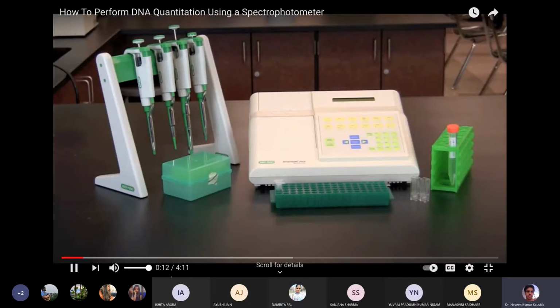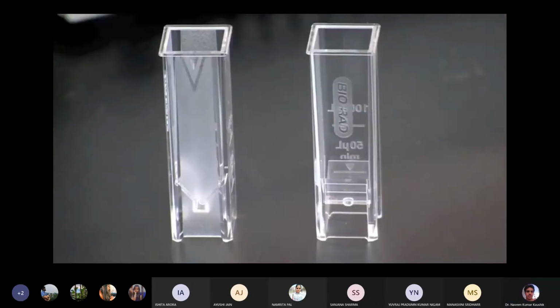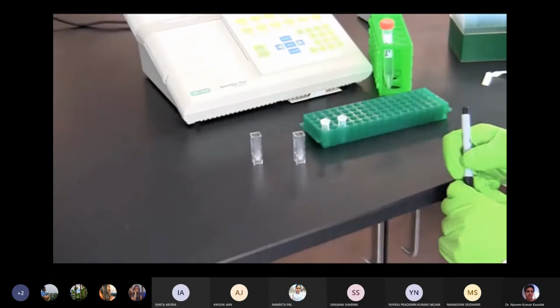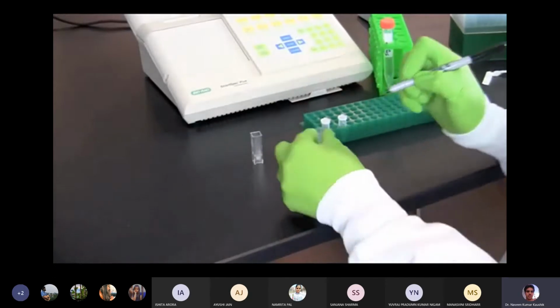To quantify DNA. In this activity, the amount of DNA in the purified plasmid preparation will be estimated using a spectrophotometer. Approximately 10 minutes before starting the experiment, turn on the spectrophotometer so that it has time to warm up. You will need two cuvettes that are transparent to UV light. When handling the cuvettes, always place your fingers on the opaque side and not on the transparent surfaces of the cuvette. Label one of the cuvettes C for control, and the other cuvette will be your test.